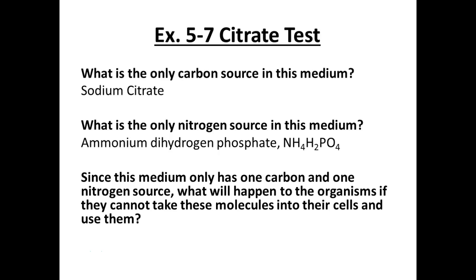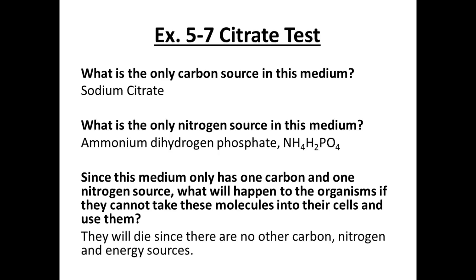Since this media only has one carbon and one nitrogen source, what will happen to the organisms if they cannot take in these molecules into their cells and use them? They perish. They die, right? So you'll notice those of you that have a green slant, you shouldn't have any growth. If you think you're seeing growth, it's probably a heavy inoculum, like you put too much bacteria on there to begin with. They didn't actually grow. And these are so old that you really shouldn't see anything at all.